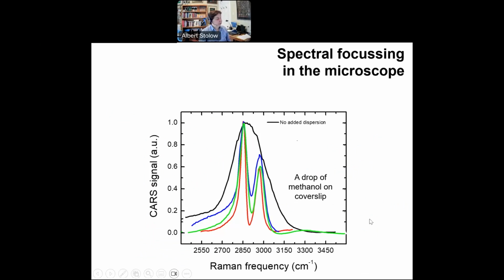So this chirping, this spectral focusing, or if you like pulse shaping, only exists in nonlinear optics. In linear optics, this phase is of no consequence. In linear optics, the only thing that matters is the spectrum. So nonlinear optics gives us new tools, new opportunities for controlling the light. In other words, what we're doing here is engineering the light, which is a new approach to microscopy.